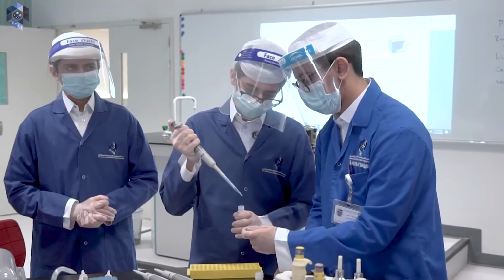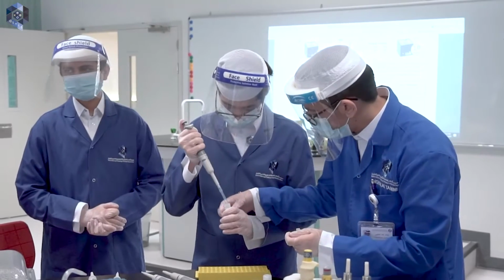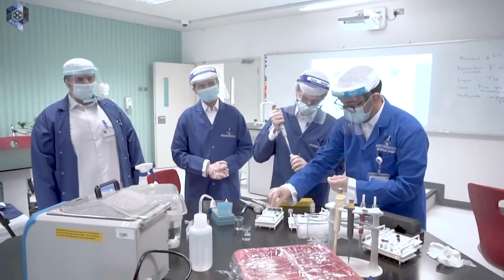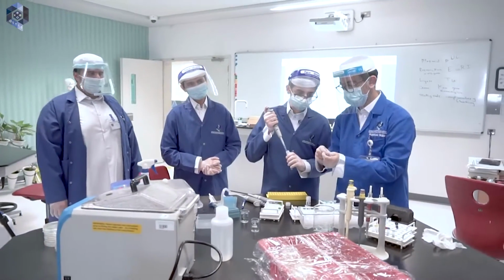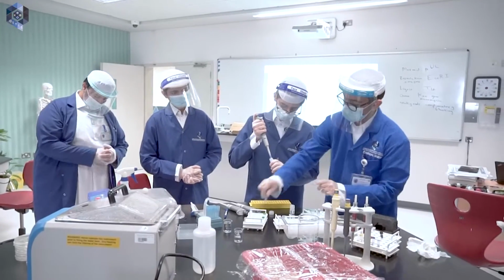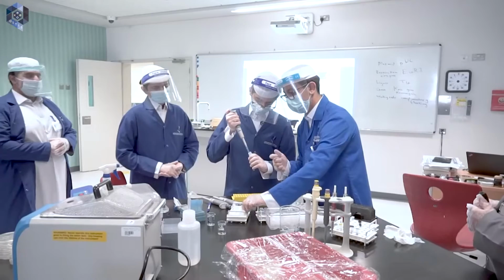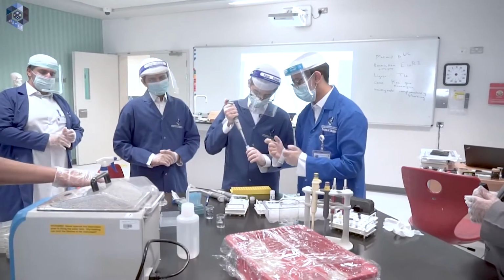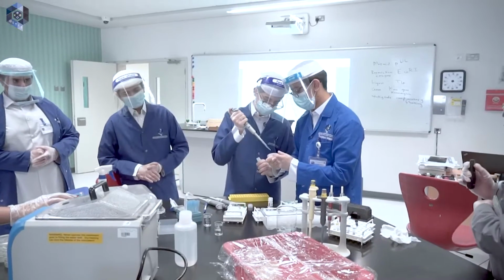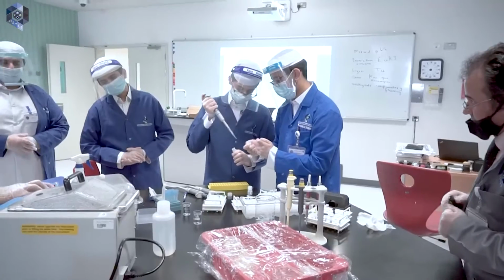Now, back again. If we skip this step, what do you expect to happen, Mary? Repulsion. Yes, repulsion between the DNA and the cell membrane. Good. Why are we not working under sterilized conditions? Because we're still not using the bacteria.